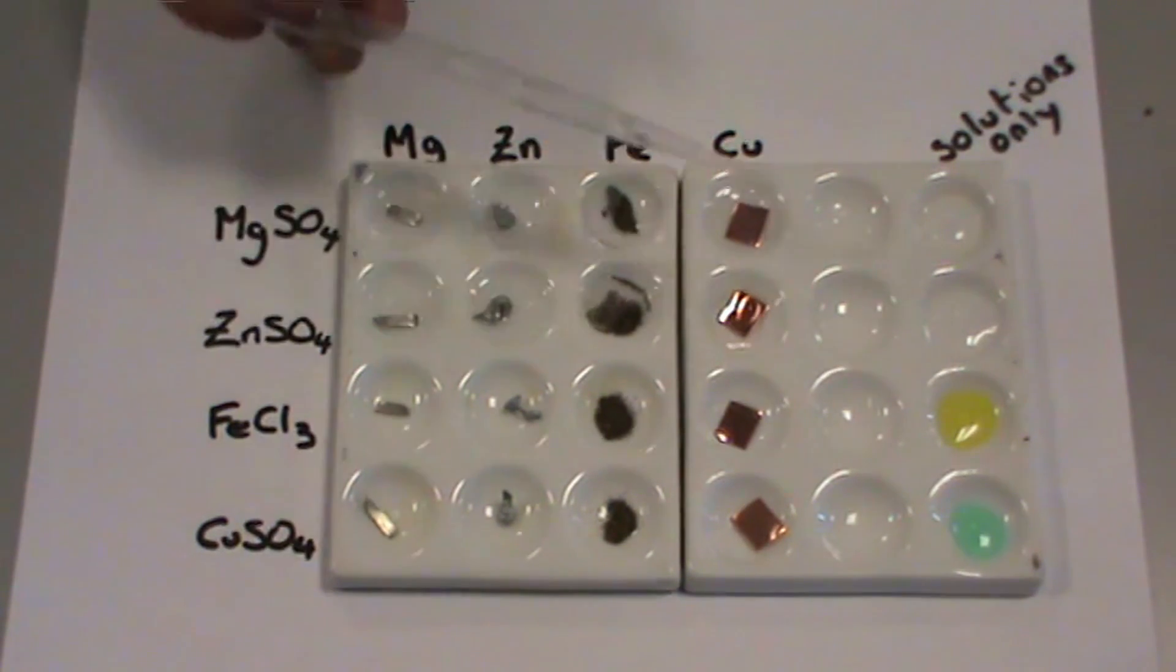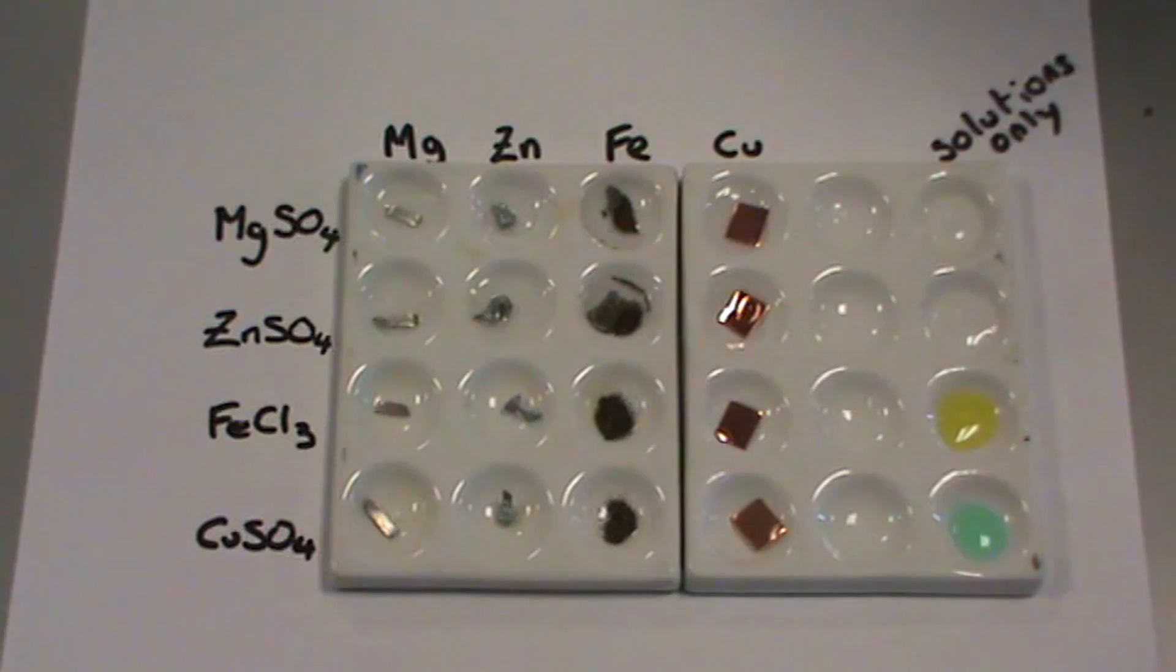The sign of a chemical reaction, in this case, is normally a colour change. That can be a colour change on the piece of metal or a colour change in the solution.